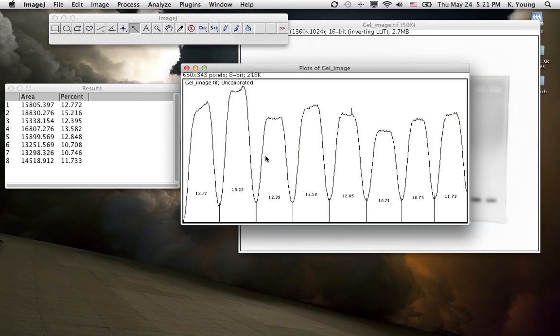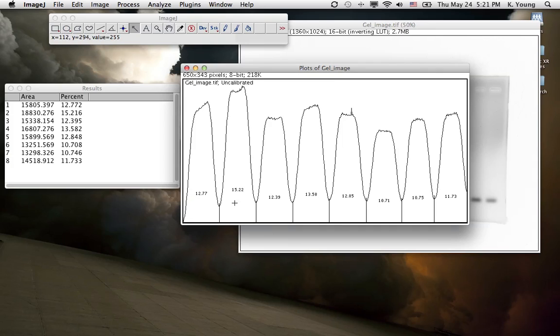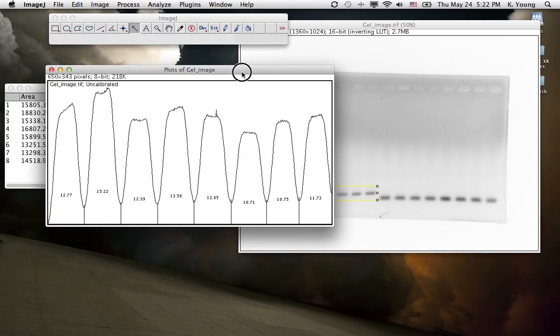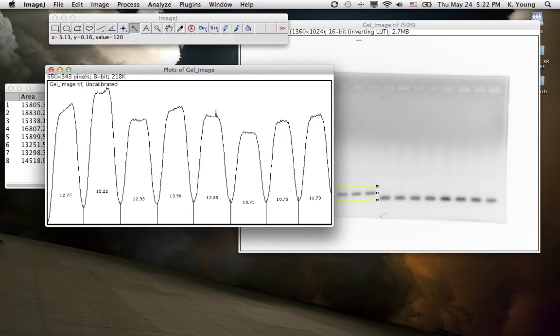And then from there, we get these values of these percentages here, and we have these values now. It would appear here that this peak here is the lowest in intensity.